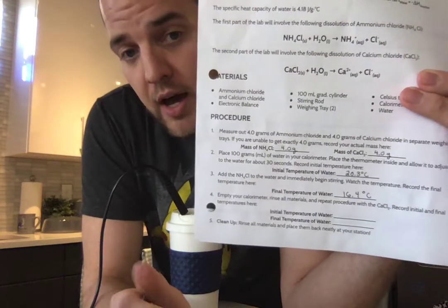Now I immediately begin using the thermometer to stir it and swirling it around. And oh my goodness, it's getting colder, guys. That's what ammonium chloride is supposed to do. So final temperature of the water, let's record as 16.4 degrees Celsius. So under number 3, I've recorded 16.4 degrees Celsius as the final temperature of the water. All right, so I am going to reset this.